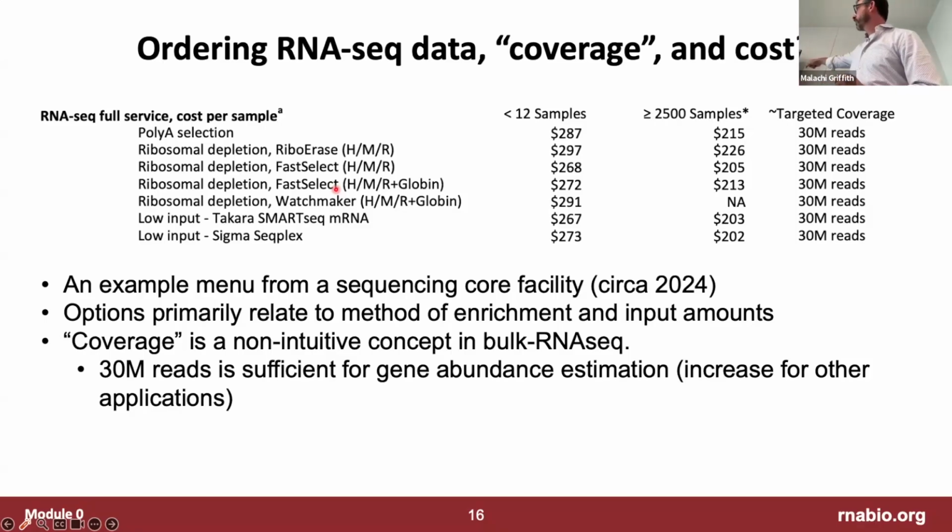So coming back to the 30 million or 25 million reads, which kicked off this whole discussion about replicates, generally speaking, it's a good rule of thumb to do more biological replicates and choose a reasonable amount of sequencing for each of those samples. There are exceptions though. Remember I said that the focus of this paper's analysis was differential gene expression analysis. So they were asking the question, how many reads does it take to get a decent abundance estimate for most genes, like a microarray kind of output? But that might not be your question.